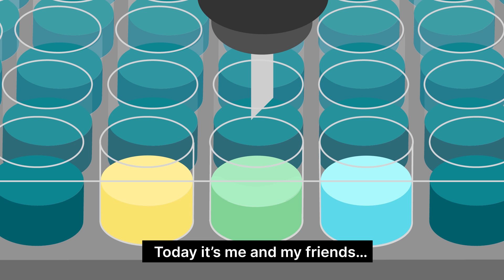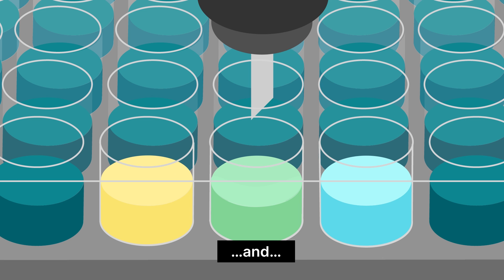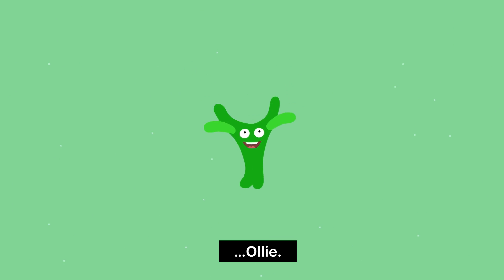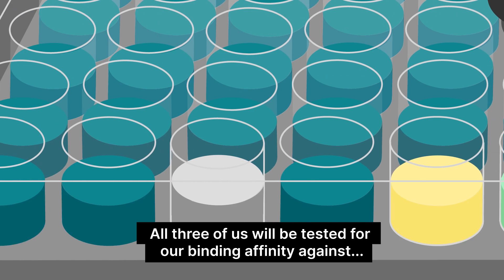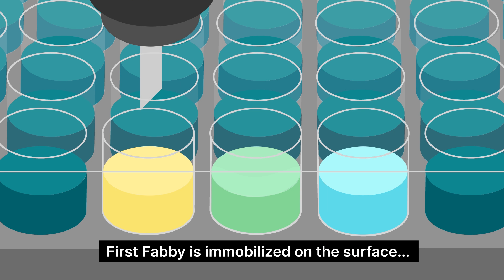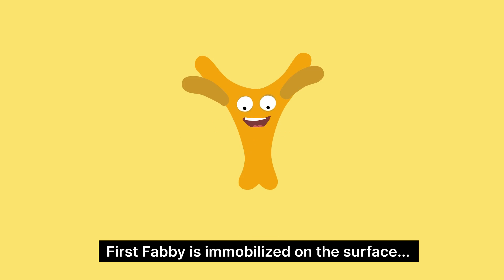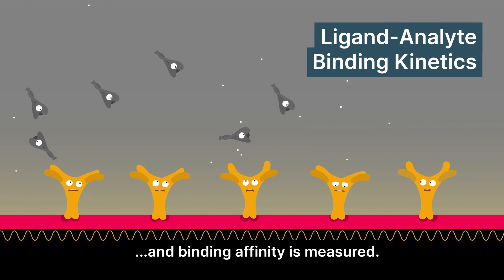Today, it's me and my friends, Fabi and Ollie. All three of us will be tested for our binding affinity against Pep the Protein. Ready? First, Fabi is immobilized on the surface. Then Pep is injected over the sample, and binding affinity is measured.